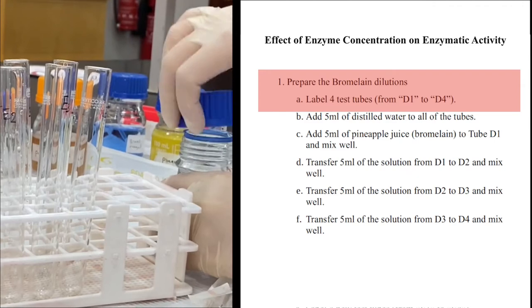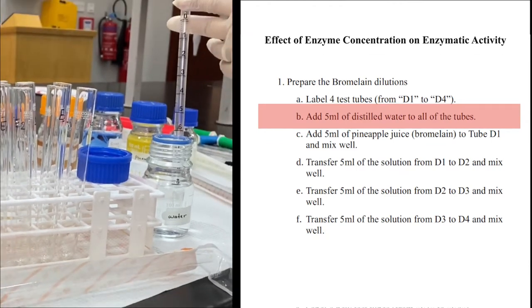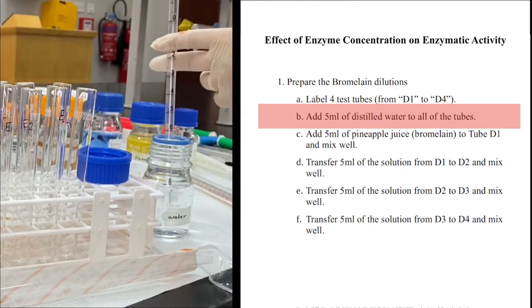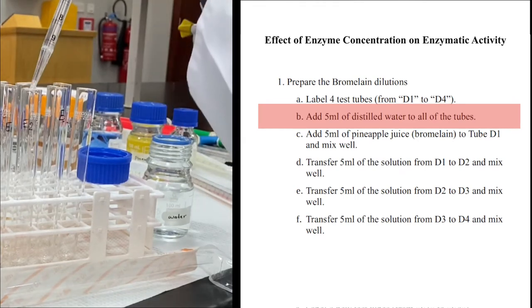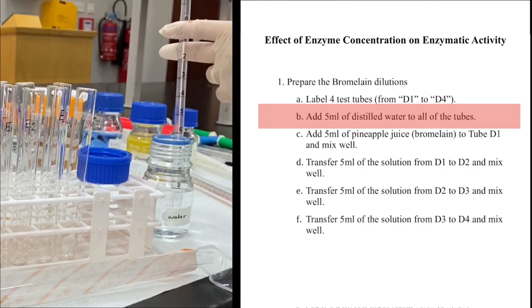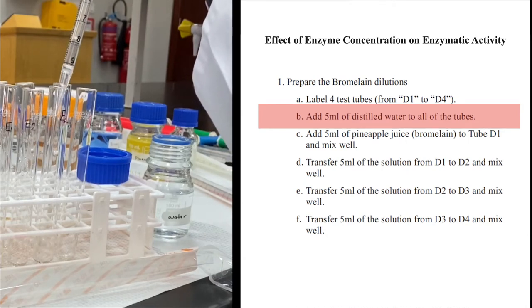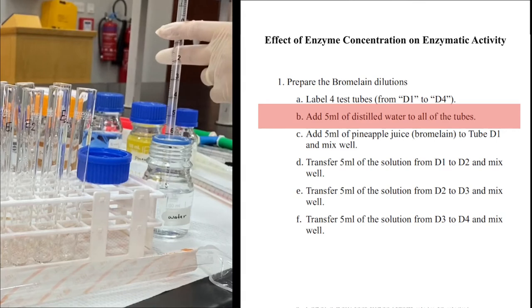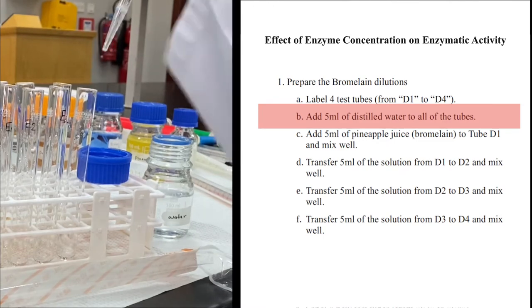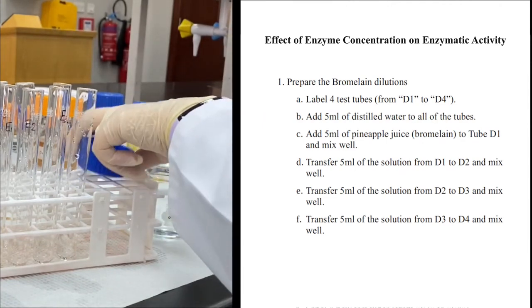We are using a 1-to-2 serial dilution today. I need to put 5 ml of distilled water in each test tube, then add the same amount of pineapple juice to the first test tube. Mixing 5 ml of pineapple juice with 5 ml of distilled water gives a 1-to-2 dilution — the enzyme concentration is halved. Transferring 5 ml from one test tube to the next keeps dividing the concentration by 2, giving 1/4, 1/8, and 1/16 by the end.